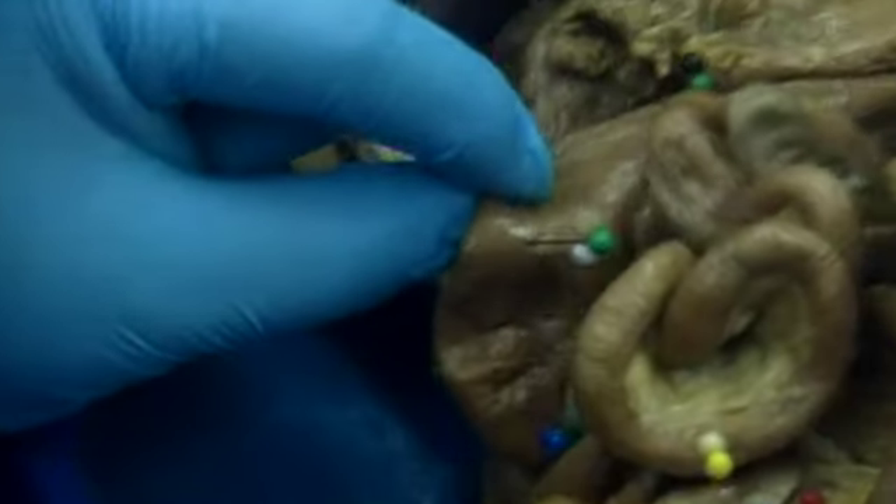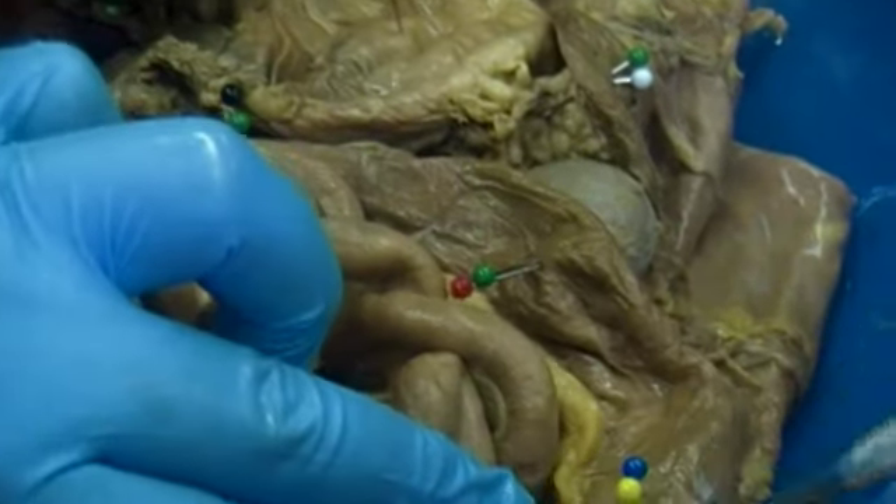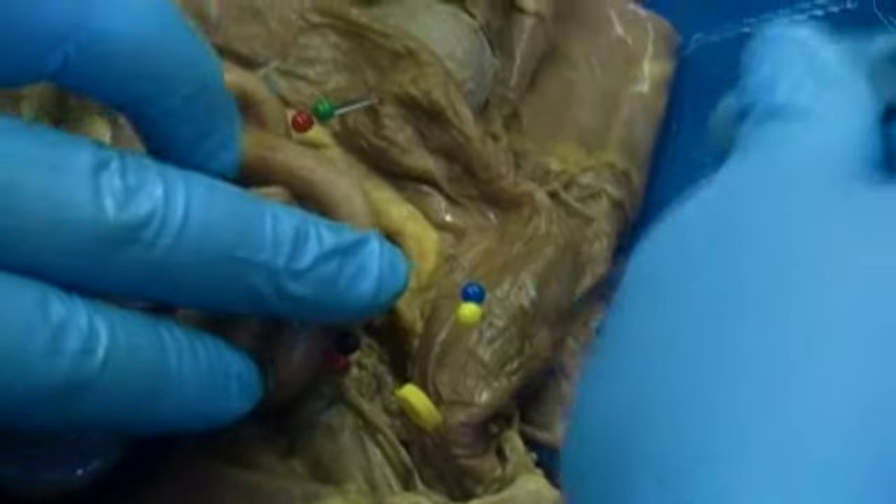Then we have this part of the colon going across, labeled with green and black — the transverse colon. Then this part going down, labeled with green and red, is the descending colon. And then this part making a little S-shape is the sigmoid colon, labeled with a blue and yellow pin.